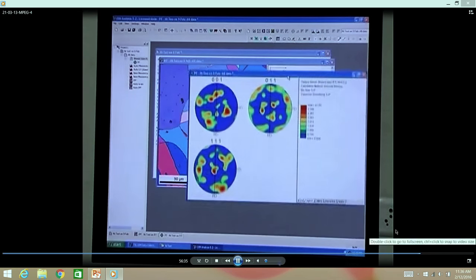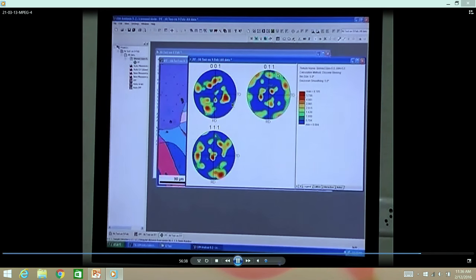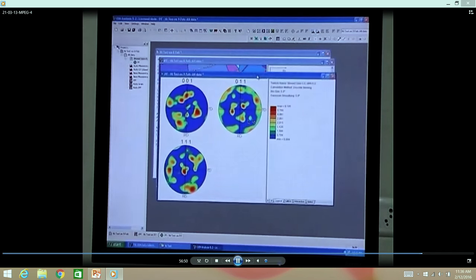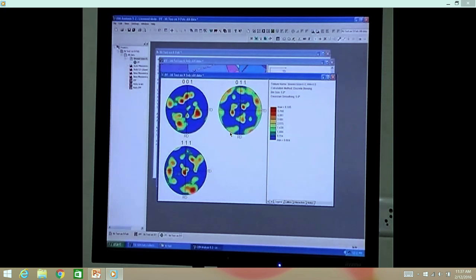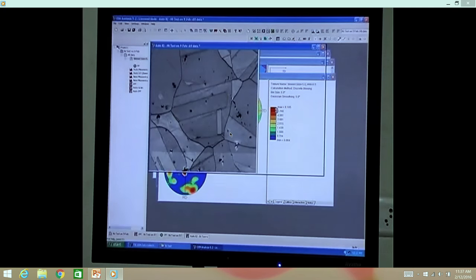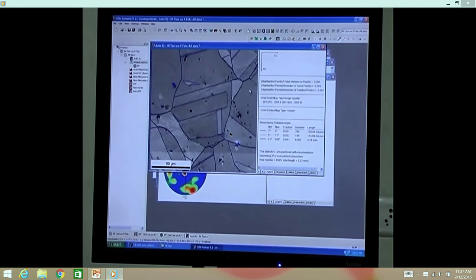Yeah. So, this is a pole figure which also shows the texture within this top 20 nanometer layer of the sample, and it shows kind of a random texture here. It is not showing any particular texture, and we will show you some of the sample where it exclusively shows a very nice texture.